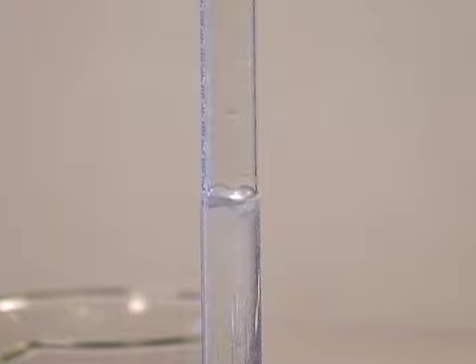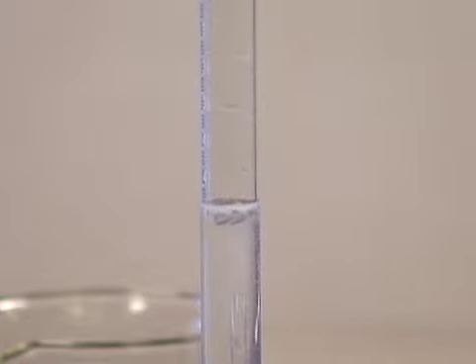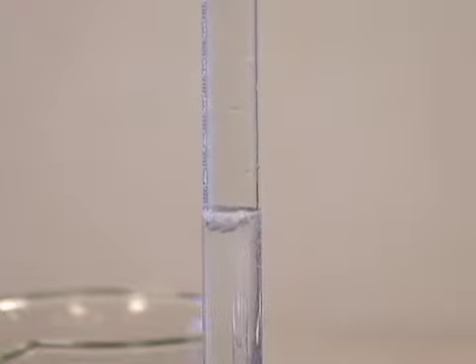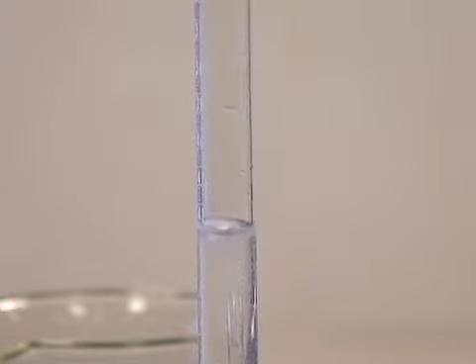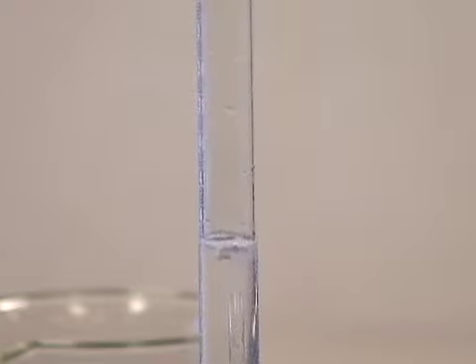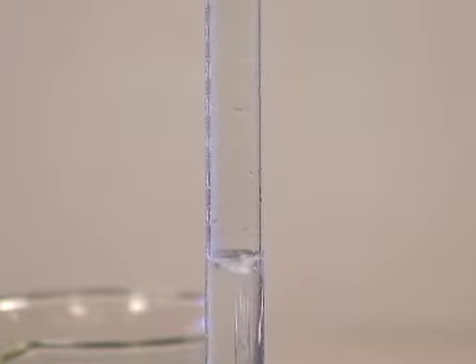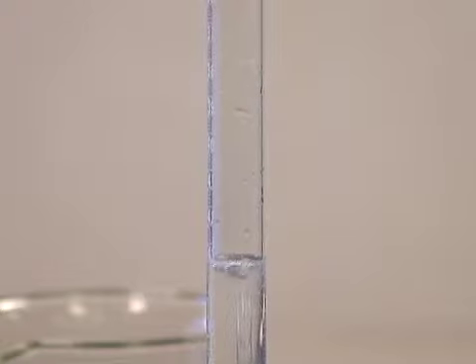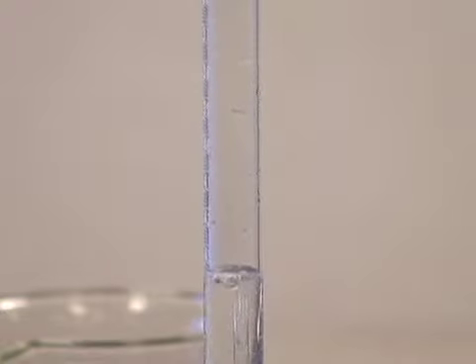Now, it is possible to set this up with lab equipment so that I would have a ring stand holding this eudiometer. But I find that it works just fine being like this, and then I can do it a lot more quickly than having to attach it to the ring stand. I prefer to do it this way. And we know that there's always more than one way to do something. We all have our own unique ways of doing things.